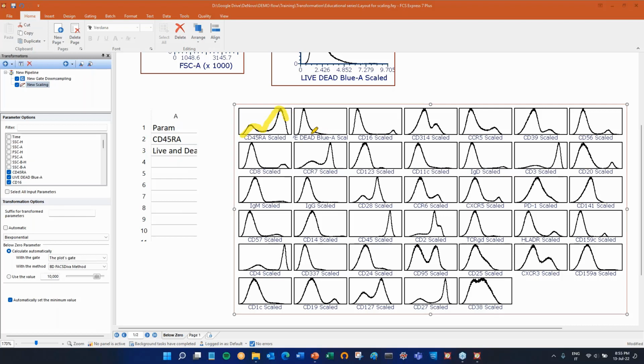You have peaks. In this case, you cannot really see that peak, so I will show you. You can still put your hands on it and change something specifically, but most of the time you see that positive and negative peaks are really well homogeneous. Sometimes it's hard, like in this case.